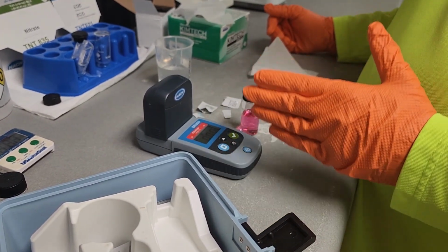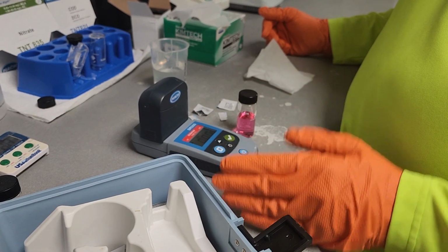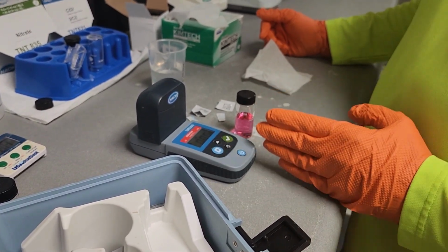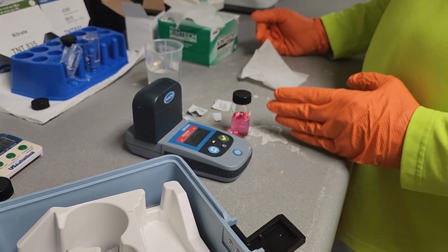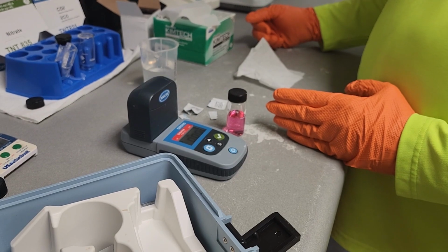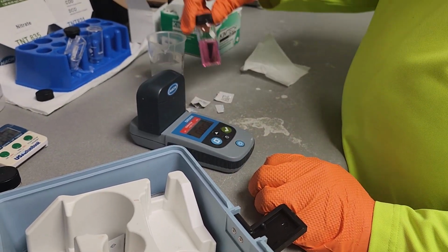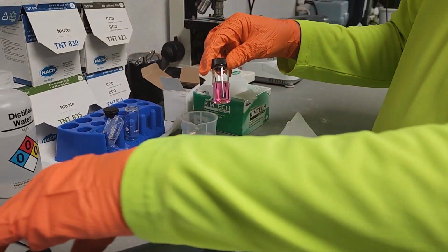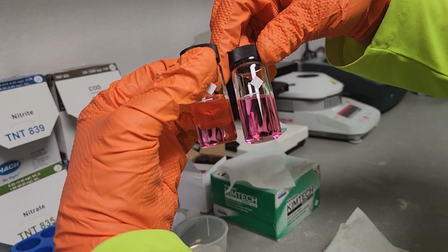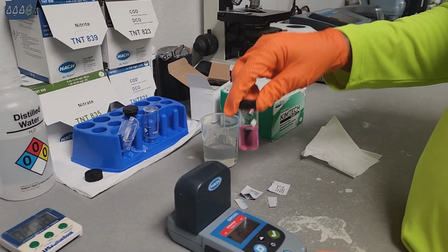But then, as you increase the dose and give it more time, that's when you form chloramines. And as you increase the dose, it'll destroy the chloramines. You'll reach your breakpoint, but you won't know that until you can get a free chlorine residual. See how this one's still reacting? Look at the difference there. That's the free chlorine.